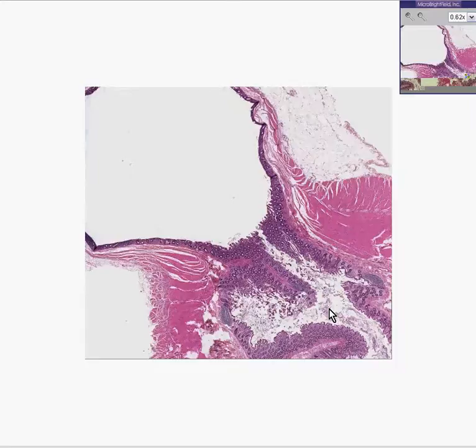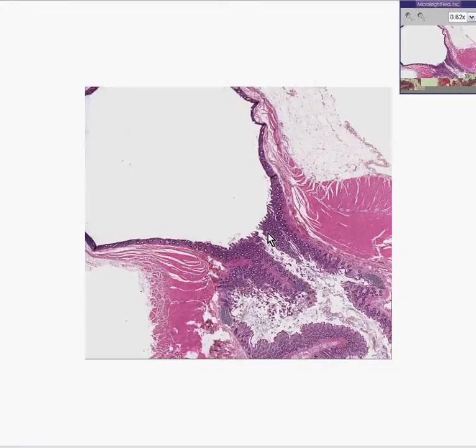They can frequently become inflamed like an appendix can, and they can mimic acute appendicitis clinically — perhaps even on the same side. But generally speaking, the diverticula are more common on the left side, although they can be anywhere.